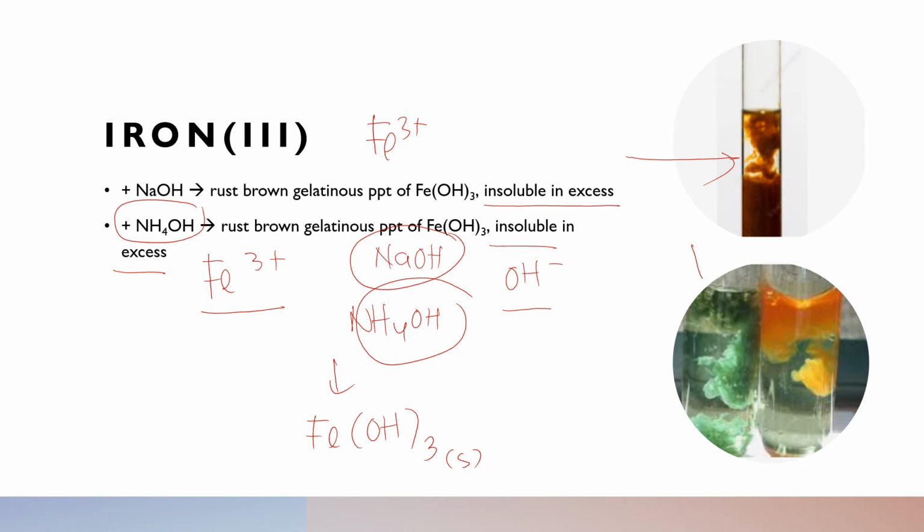For this figure, the green one is Fe2+, the orange is Fe3+. I mean the green here is not Fe2+ but Fe(OH)2.